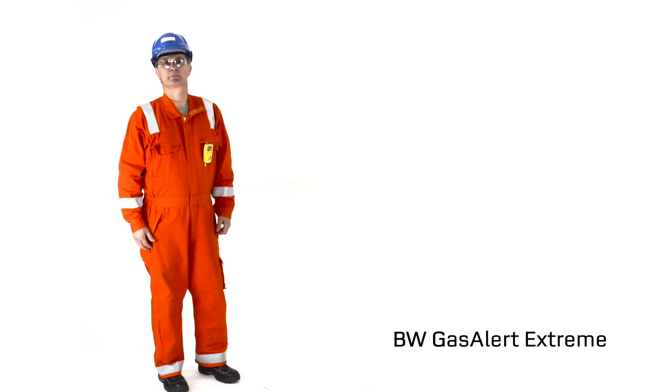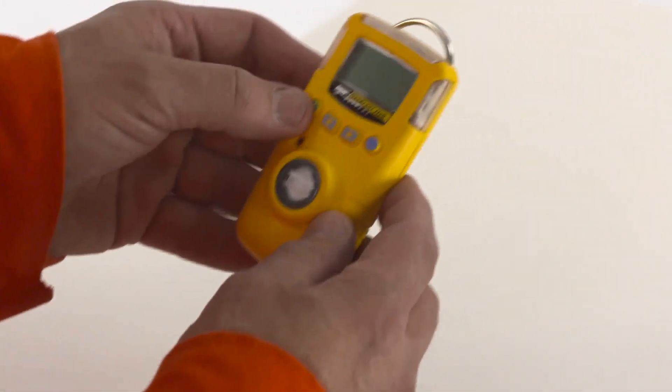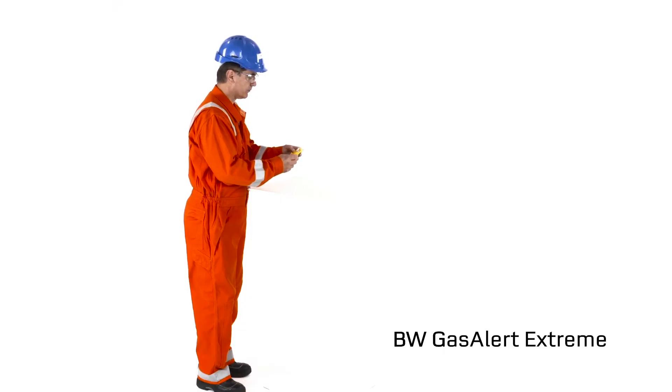Procedure for BW Personal Gas Detector. Upon receiving or collecting a personal detector, it is recommended to perform the following basic checks.